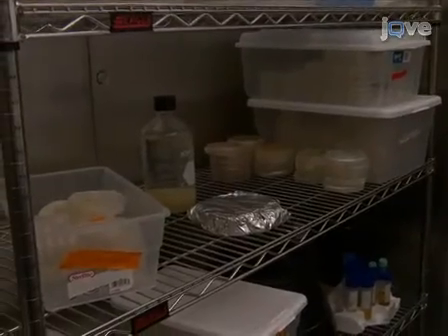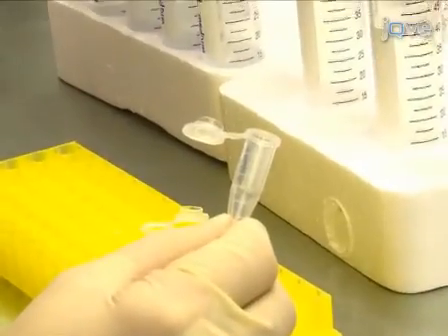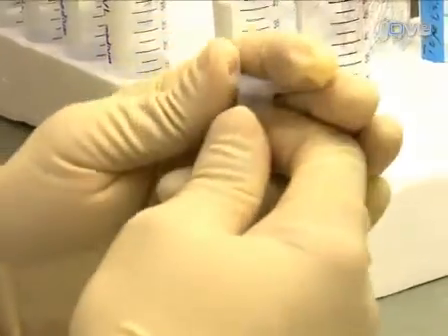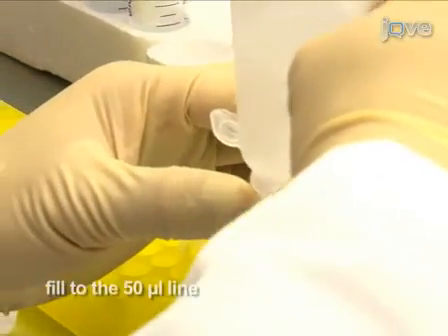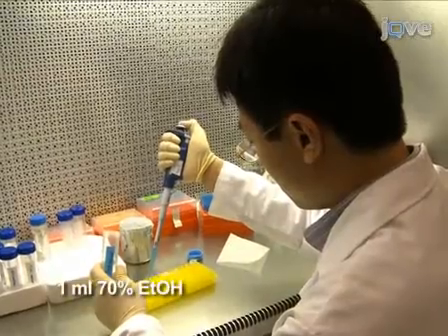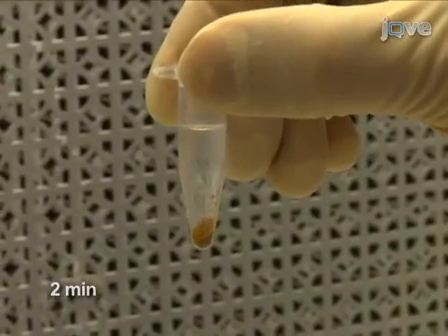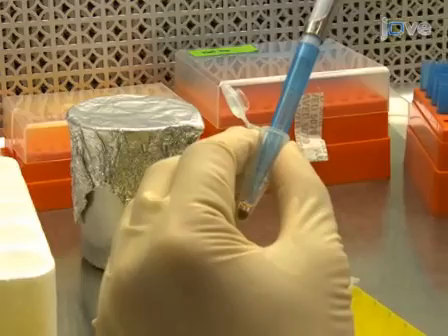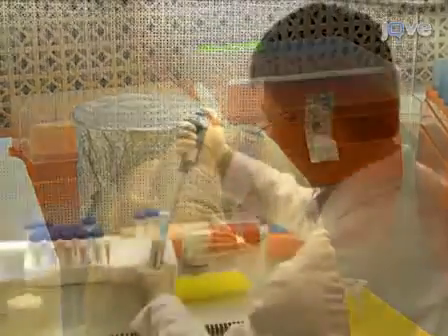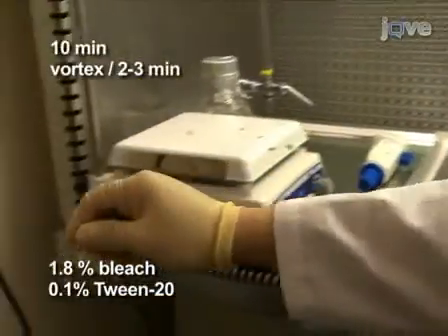Now that the plates for growing the plants are ready, let's prepare the Arabidopsis seeds. Start growing the plants by sterilizing the Arabidopsis seeds. For plating on one petri dish, place seeds in an Eppendorf microcentrifuge tube in an amount equivalent to 50 microliters of volume. First sterilize with ethanol by adding 1 milliliter of 70% ethanol and mixing well. Incubate with the ethanol for 2 minutes, during which time the seeds will sediment. Next sterilize with bleach by adding 1 milliliter of a bleach-Tween solution and mix for 10 minutes by vortexing every 2 to 3 minutes.